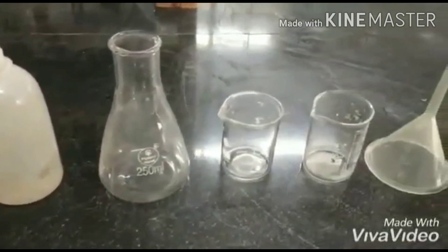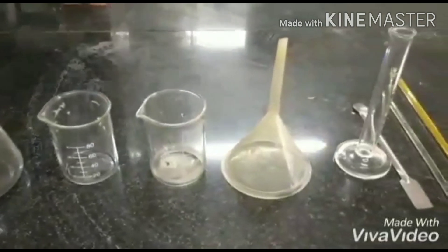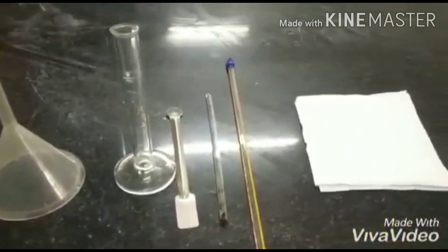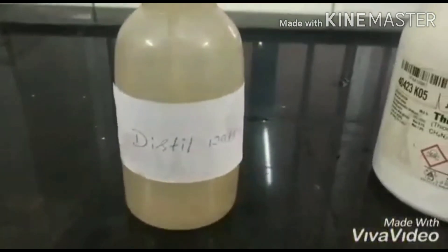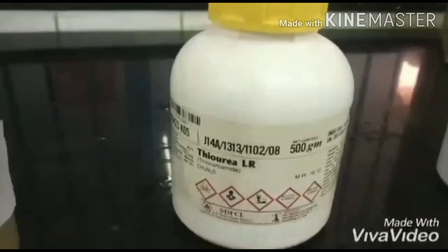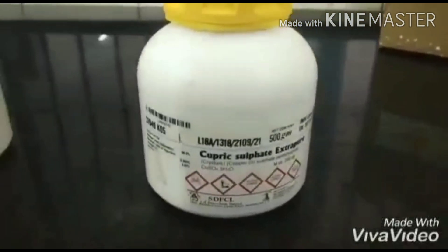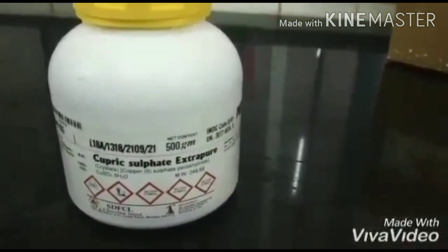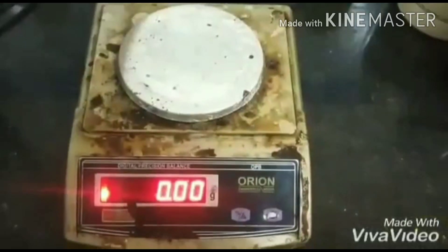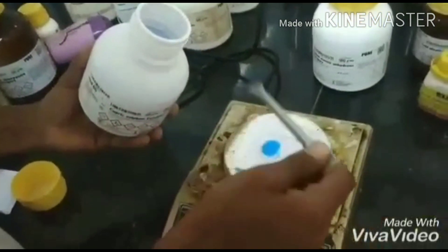In this experiment, we will cover the preparation of thiourea copper(I) sulfate. These are the apparatus required. The materials needed are distilled water, thiourea, copper(II) sulfate, and concentrated sulfuric acid.